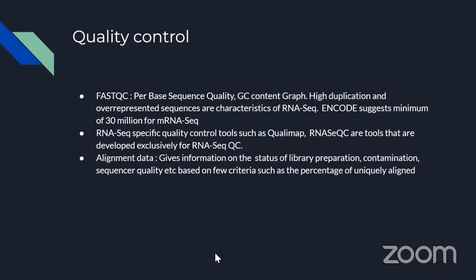If you're using an aligner such as STAR, it would not matter because it will do a lot of soft clipping by itself. But if you really want very good alignment statistics and everything, I would recommend you trim those, or do a filtering based on the quality or something like that. There are several tools to do this trimming for RNA-seq. Like we can also use Cutadapt.